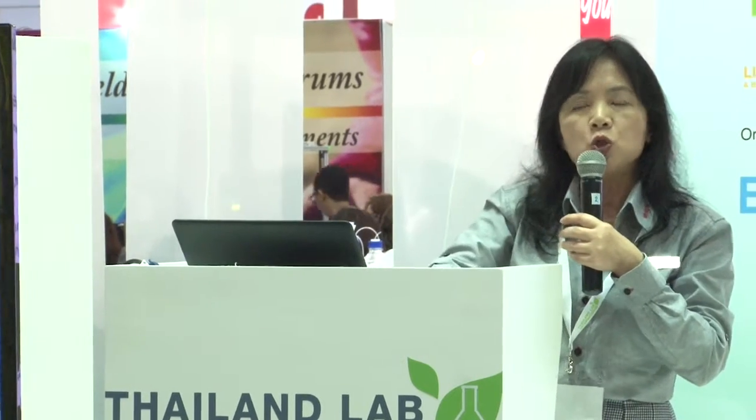So isotope ratio is used for dating and fingerprinting. If I want to know how old a rock is, I can measure the ratio between uranium and thorium isotopes, and then I know, oh, this rock is 5,000 years old, 10,000 years old, etc. Or fingerprinting. Fingerprinting means that I can trace back to the origin of a certain thing. For example, we talk about drinking wine, right? Wine could come from Australia, South Africa, or the US. Because different geology in the Earth gives different ratios between strontium 86 and strontium 87, by measuring the ratio between the two isotopes, they can fingerprint and determine that this wine comes from Australia, this wine comes from the US, etc.